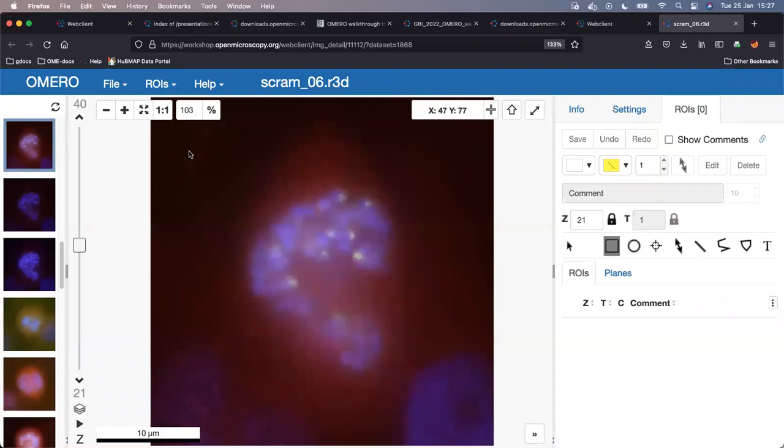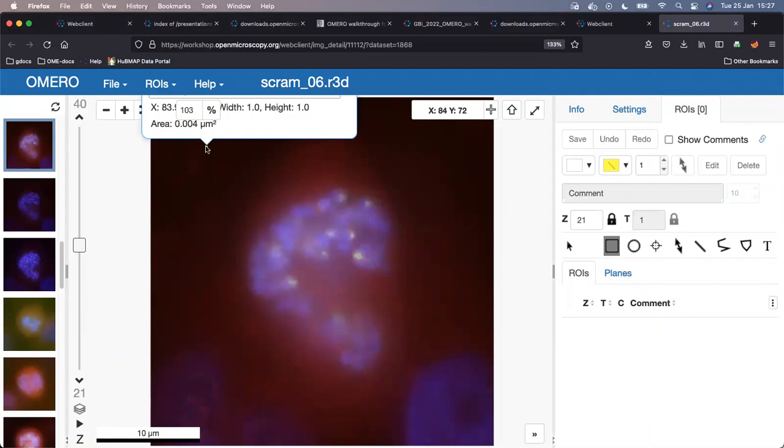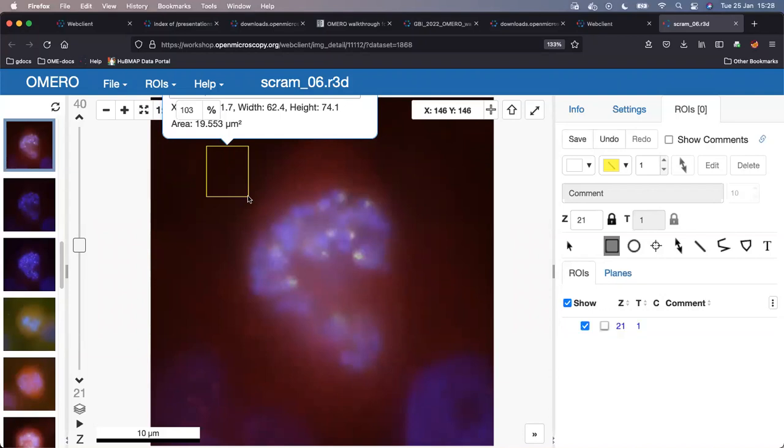Now, that is something to dwell on for a second: how to draw regions of interest in OMERO.iViewer. It's a little bit different pattern than what you might be used to from ImageJ. You click, then you let go. You can see that my finger is not in use here. I just move my mouse like so. My finger is still not in use. I just click once more, and that's my rectangle drawn.